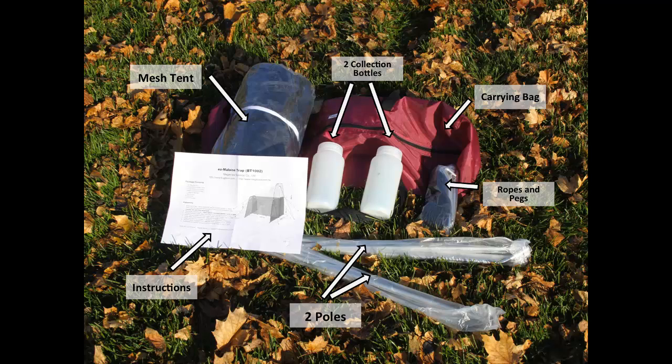Also included are a small bag containing ropes and pegs, two Nalgene collection bottles, and a rolled-up nylon fine mesh tent.